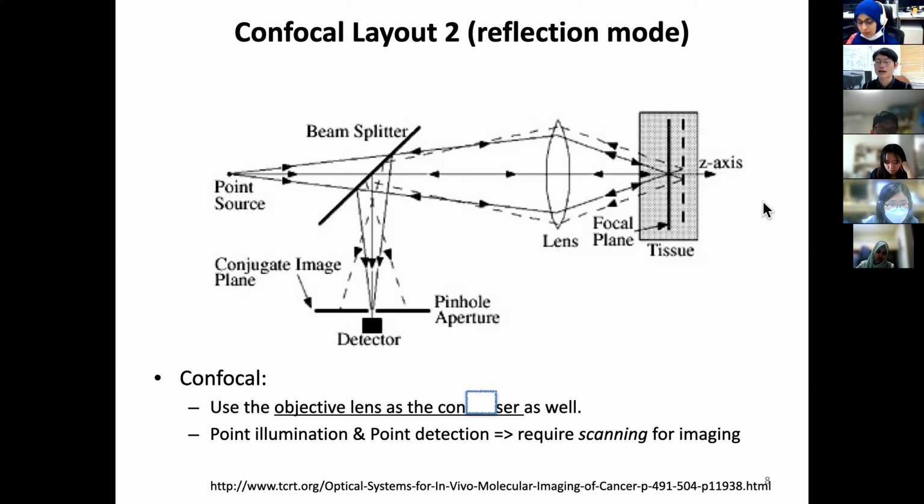And that frees the signal from the other parts of the sample. This is more practical. Think about your fluorescence imaging. You shine the light onto the sample and you collect it with the objective lens. Somehow now the shining is through the objective lens. The objective lens is serving as the, let me see, Sadaf, can you guess what this is?